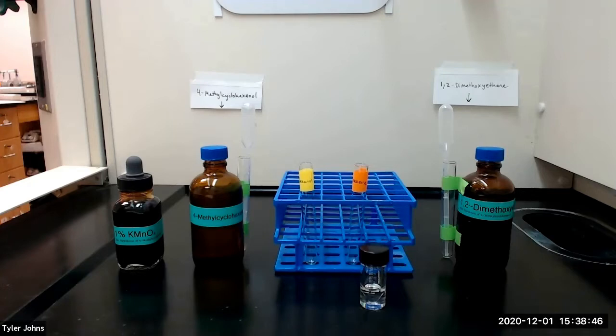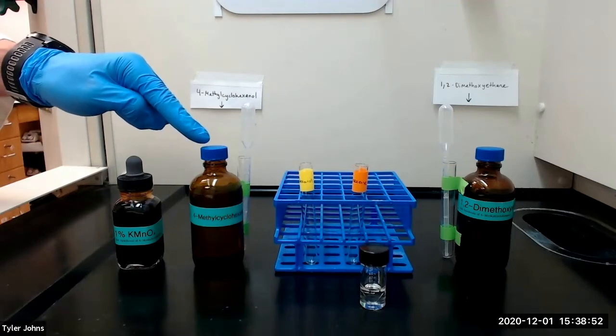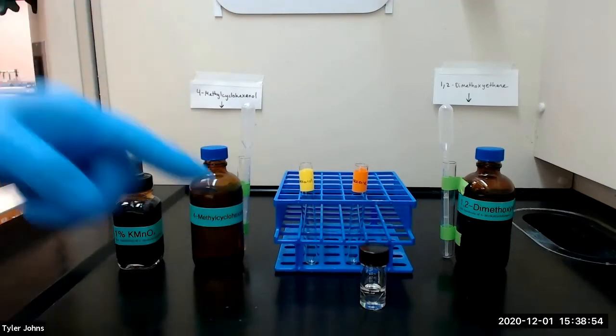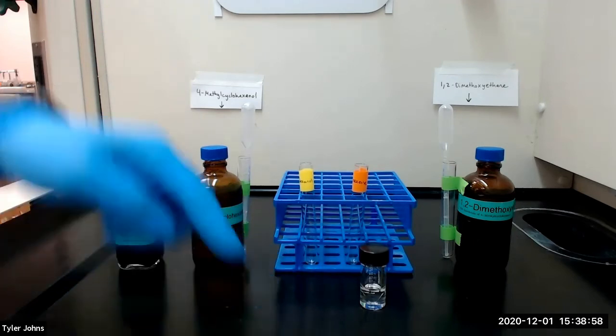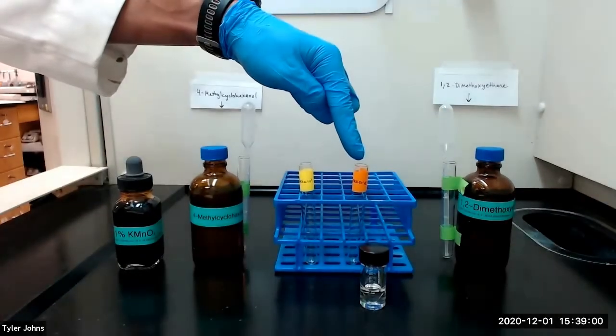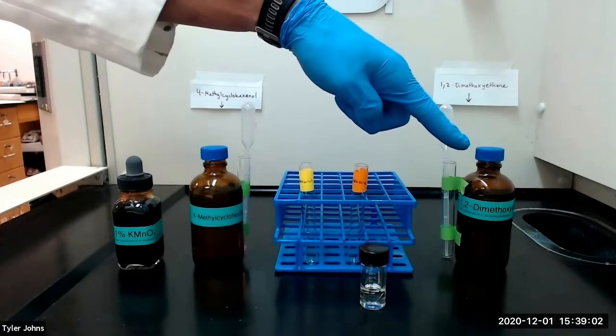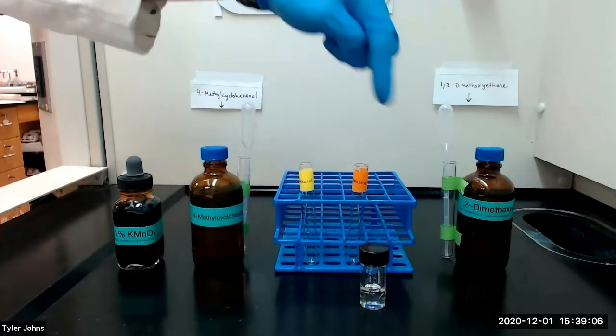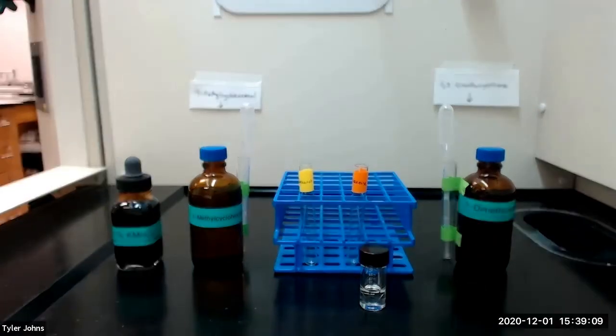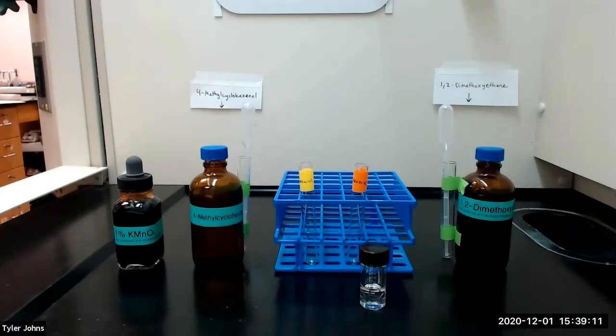We will now test the distillate for unsaturation using potassium permanganate. We will add 5 drops of 4-methyl cyclohexanol and 5 drops of the 4-methyl cyclohexene distillate to two separate test tubes. We will then add 0.3 milliliters of 1,2-dimethoxyethane to each test tube. The 1,2-dimethoxyethane allows the aqueous potassium permanganate to interact with the organic test compounds.